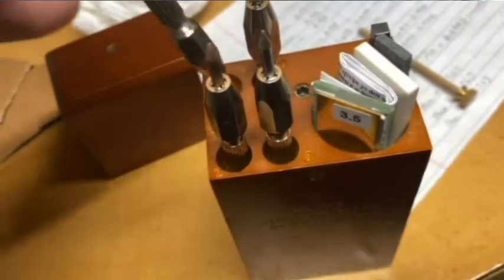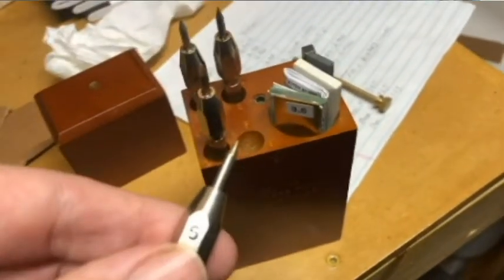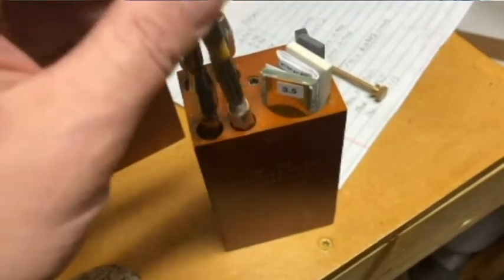So I scratched it. It scratches with the number 5, which hornblende can scratch with, but it isn't typical. It's more with the number 6. It scratches deep. It's okay. All right, I ruled out biotite. There is now no biotite. It's not that. So I'm like, what else? Well, it's got to be an iron mineral.